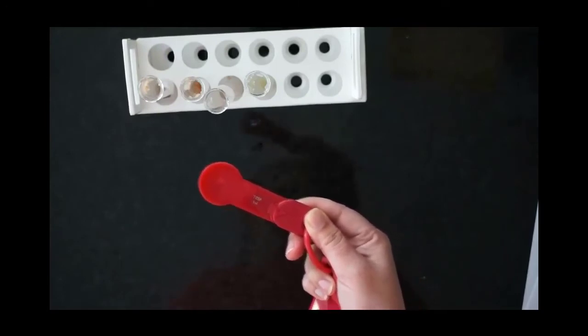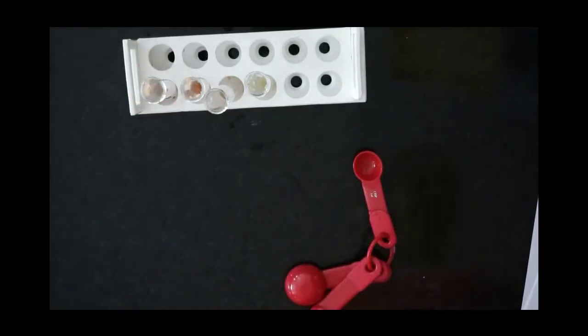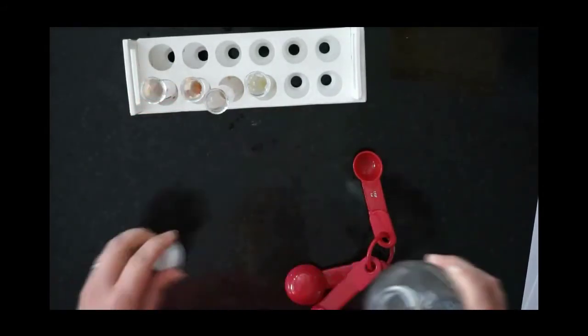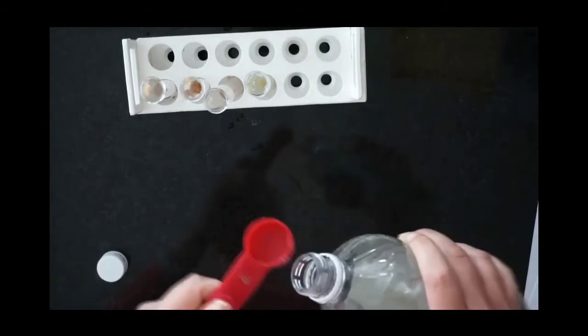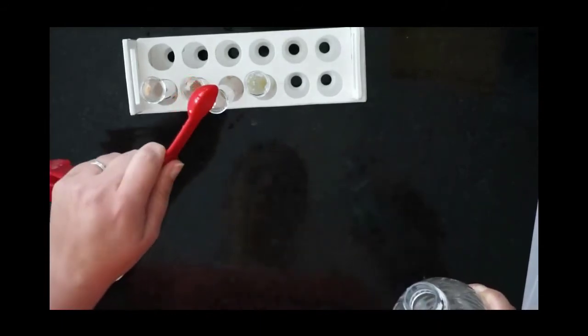As your directions tell you, we are adding one teaspoon of water to the first tube or cup, and one teaspoon of vinegar to the third tube or cup.